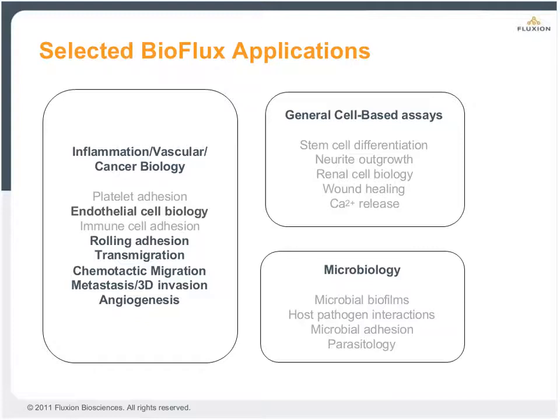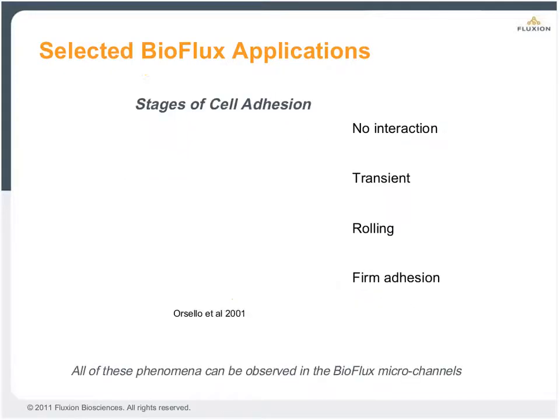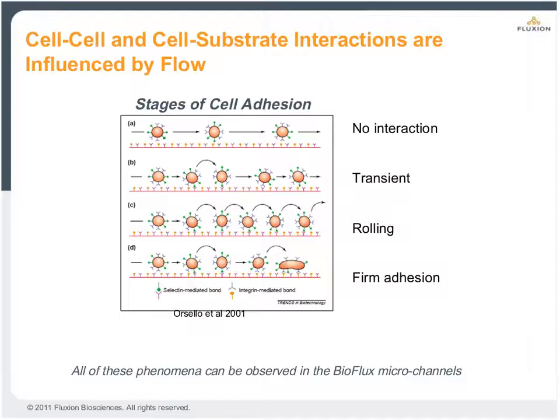Okay, to start, we're going to focus on applications that are relevant to shear or the shear delivery aspect of the BioFlux controller. So we're going to start with cell adhesion. This is what's occurring within the vascular niche in response to conditions at the endothelial wall. So this includes shear stress, as I mentioned. Here are several stages of cell adhesion in blood vessels.